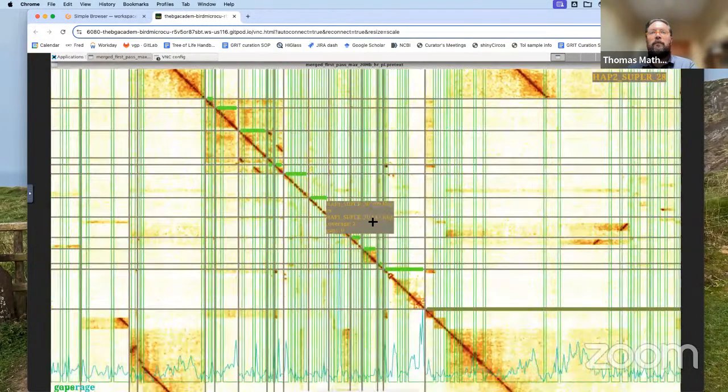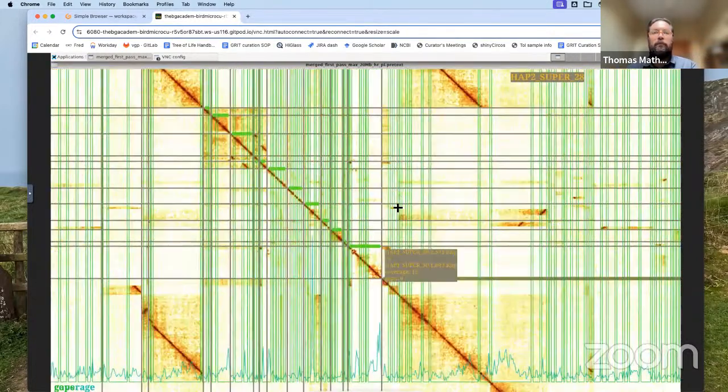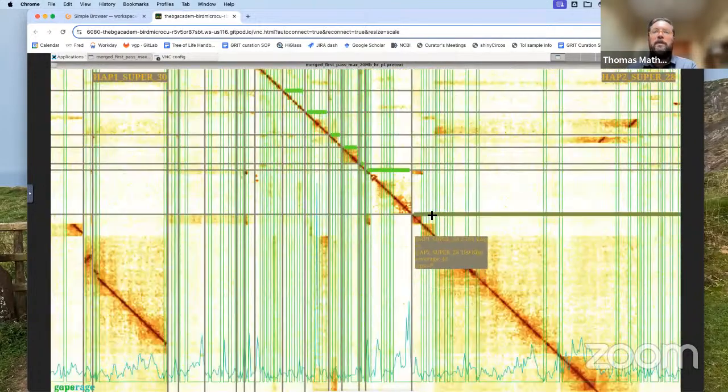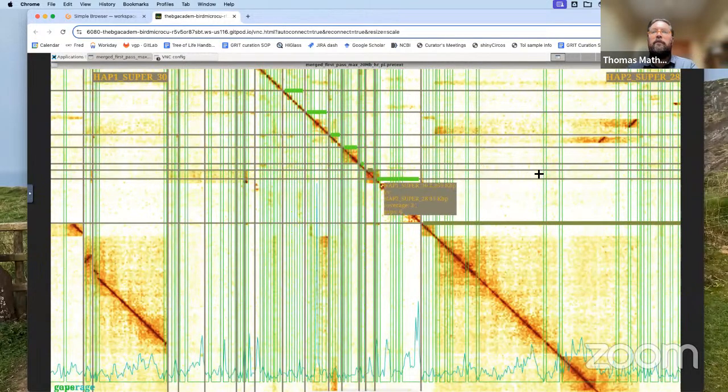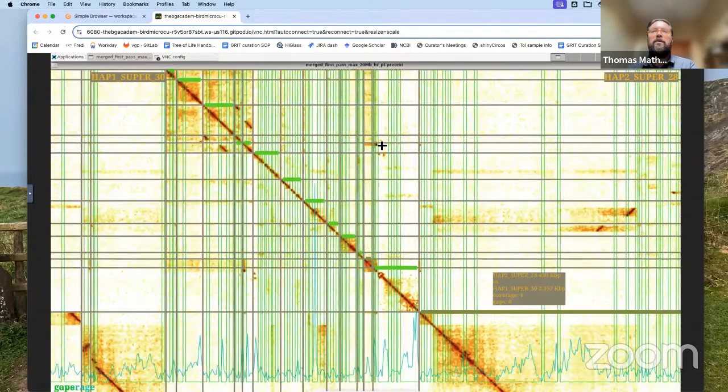Move it to the beginning. There's lots of very tiny errors in this. So here, another piece that looks like it belongs with that. And we'll check, does that go anywhere else? Well, it's got high contact with the rest of this.